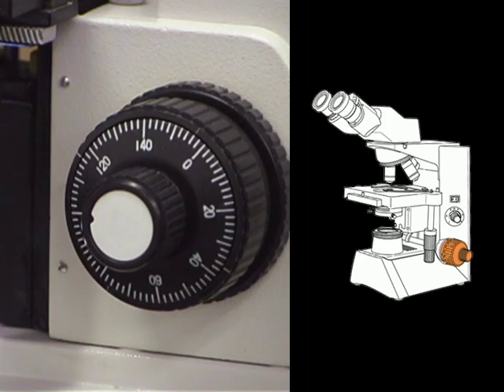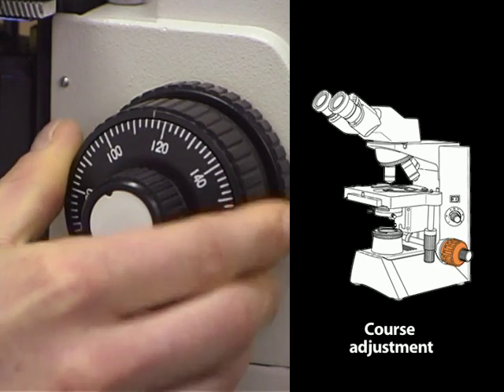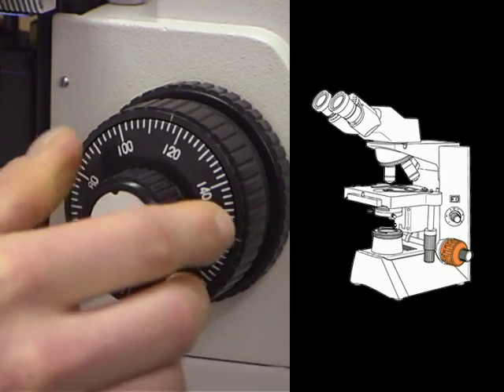There are two focus adjusting knobs on a compound microscope, a coarse adjustment knob and a fine adjustment knob. The coarse focusing knob always has a larger diameter than the fine. Use the coarse one first to get the objective approximately in focus, then use the fine one.